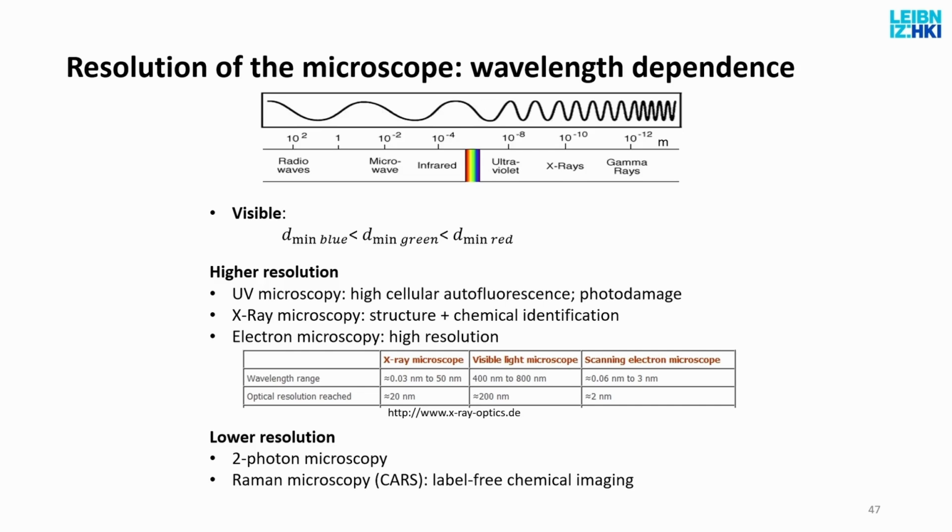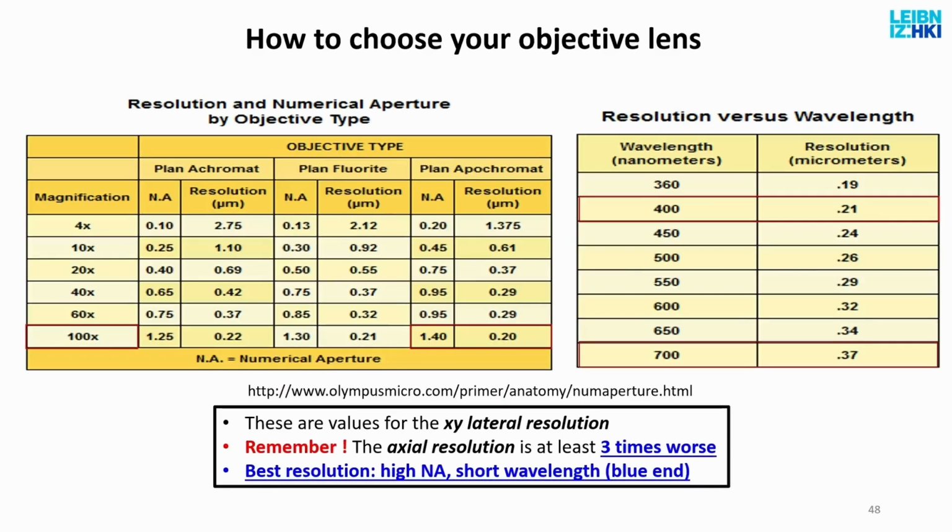Raman microscopy, it's label-free. It provides you much lower resolution, micrometer range. So you will have Raman information about the chemical structure of your molecules, but from a much larger area than 1 pixel. So you will have a problem matching pixels with the Raman spectrum.